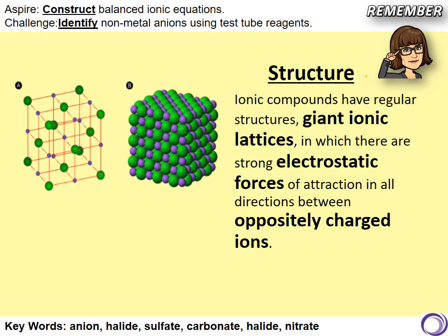The test that we're going to look at today is the test for negative ions in ionic compounds. It's important that we remember that ionic compounds exist as giant ionic lattices, which are formed by the electrostatic force of attraction between oppositely charged ions.